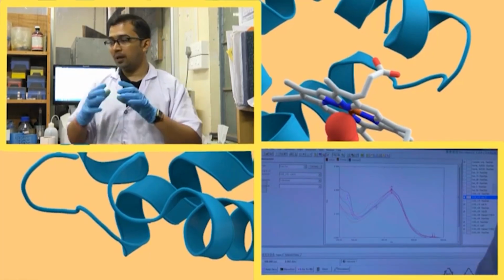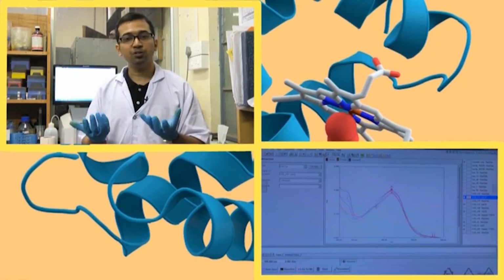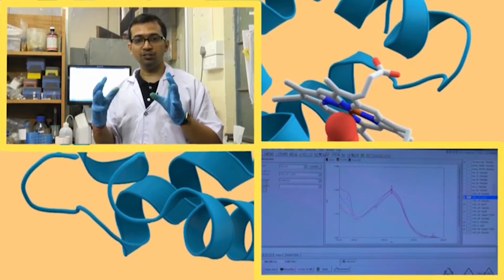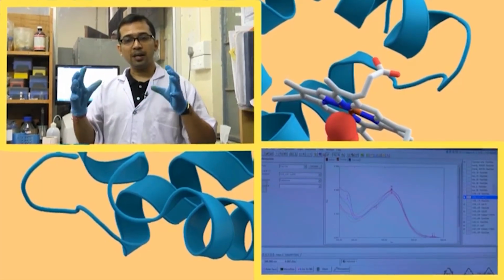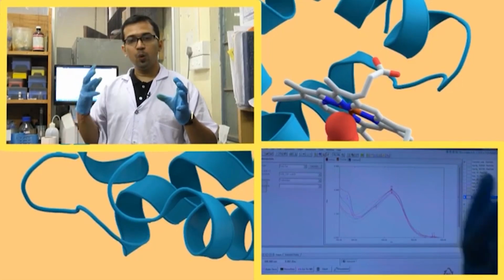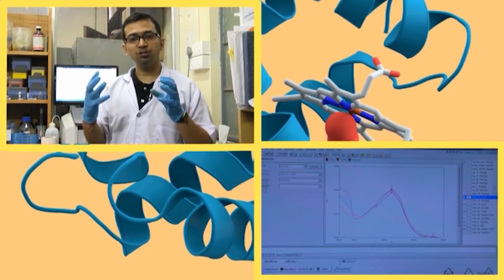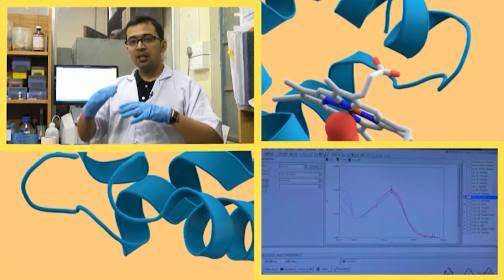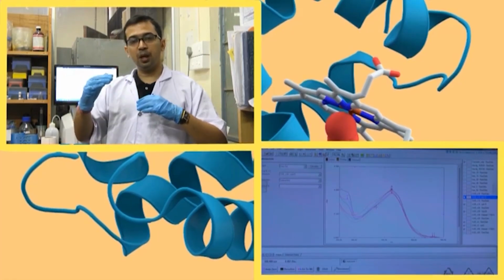Okay. So, this curcumin is no more exposed in the solution because it is in contact with our HSA, or it is exposed to a much lower extent, and as a result its absorbance value is decreasing a bit.